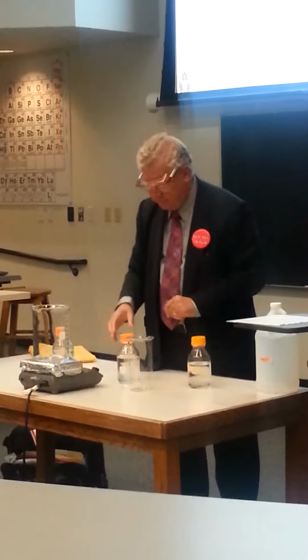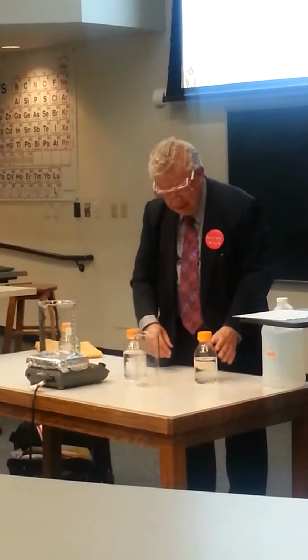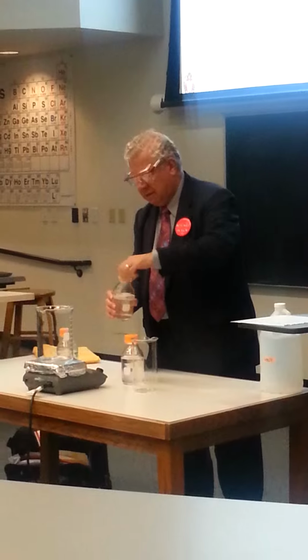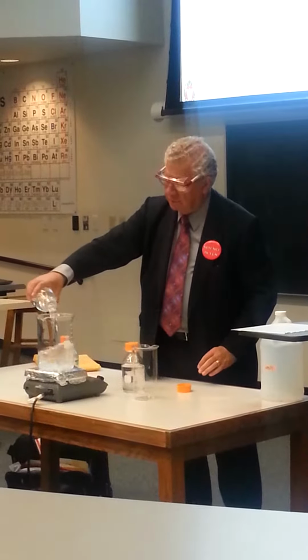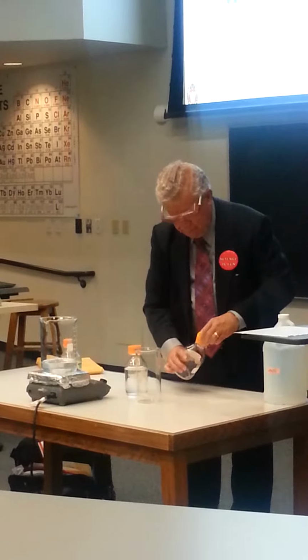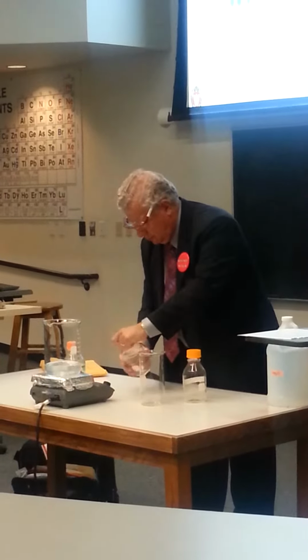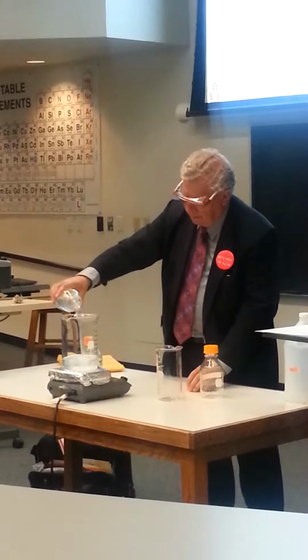So all kinds of different things. But let me get to the experiment, because that's what we're going to do here. So in this experiment, I'm going to take 3 clear and colorless liquids and mix them together in this 2-liter beaker. Here's the first liquid. And then I take the second liquid. And I add the second liquid.